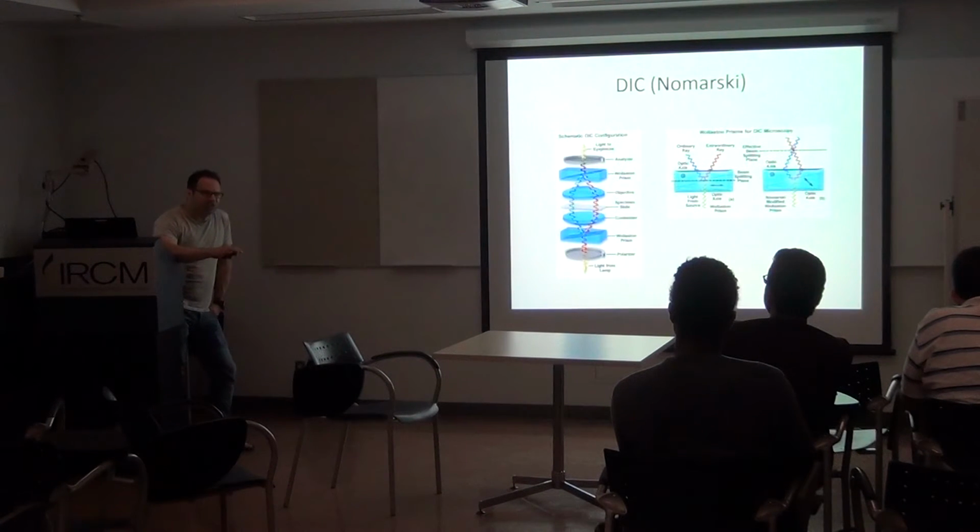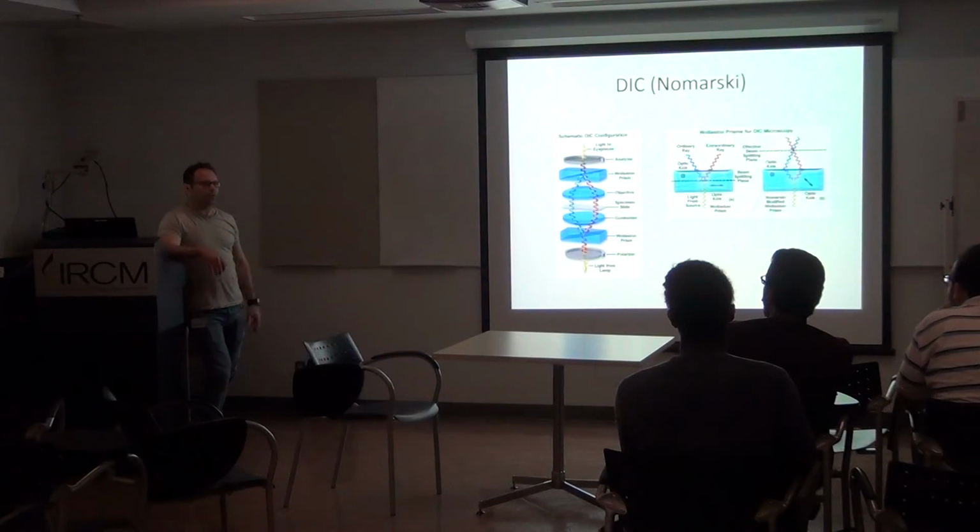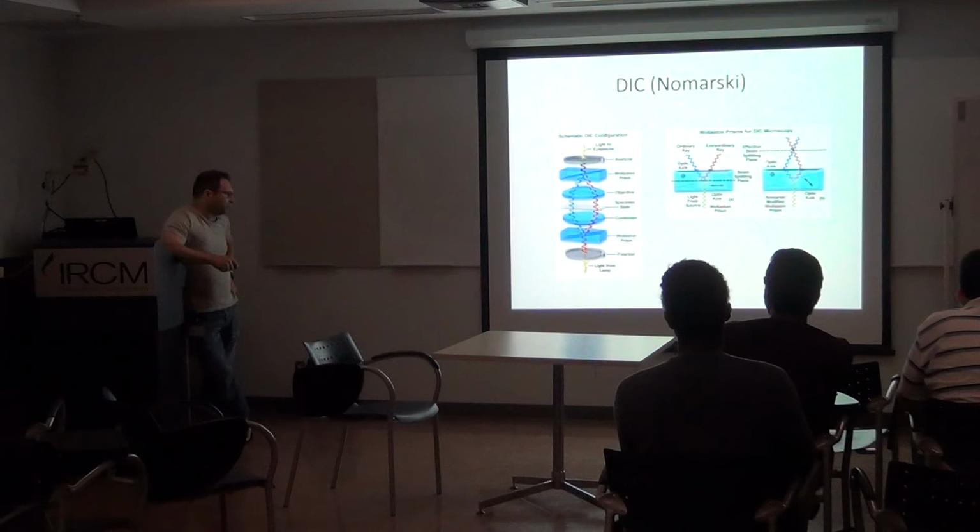So if you want to see details in bright field, without any fluorescent stain, then you would use DIC. That's another contrast method where you don't need any fluorescent probe, you don't need anything, you just need your cells, your culture or your tissue, and then you can see it.